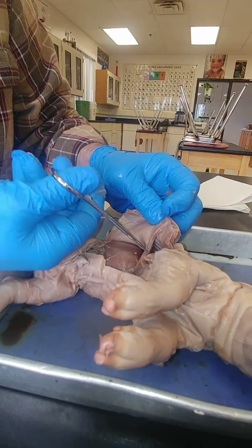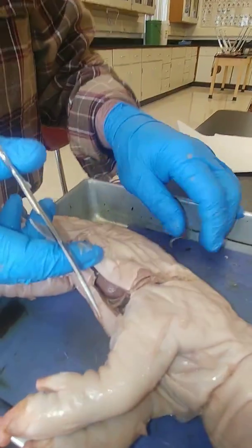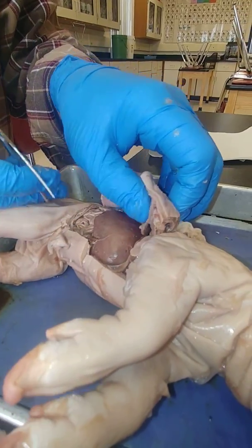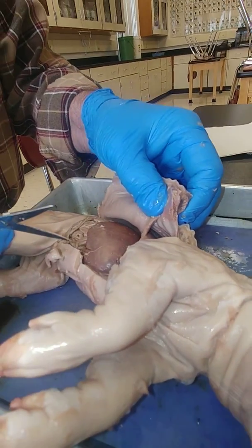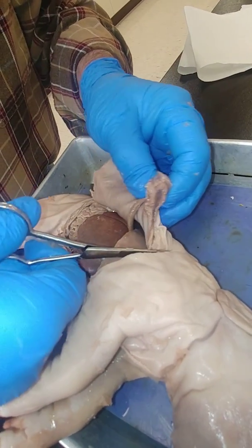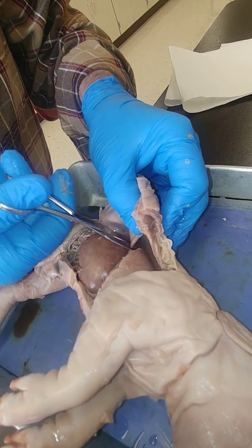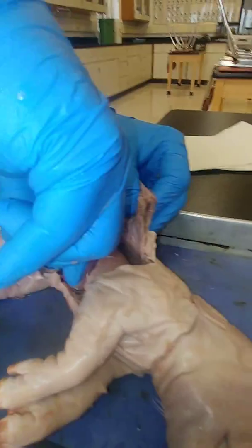So what type of tissue are you kind of cutting through right now? Well, we cut through the epithelial tissue on the outside to start with. And then you've got some of the skeletal muscles, the abdominals. We talked about in the one other video the rectus abdominis. Down there, back here, I'd be cutting through the latissimus dorsi, which is with the collarbone, and the would be the scapula in those areas there. Okay, I'm snipping the diaphragm here now.